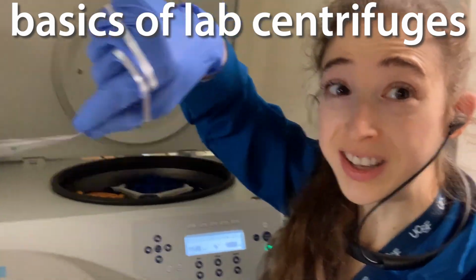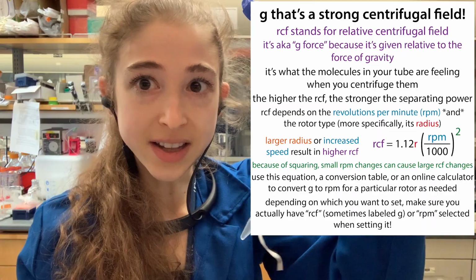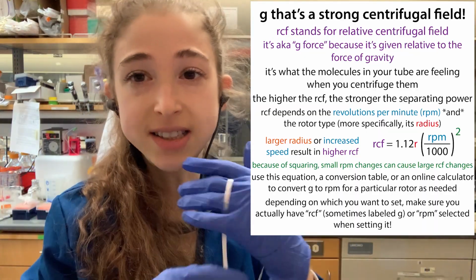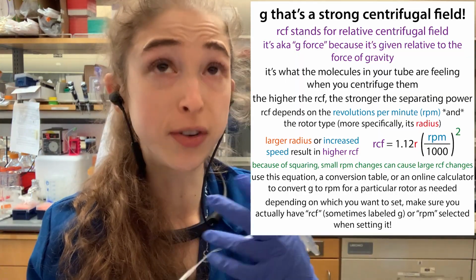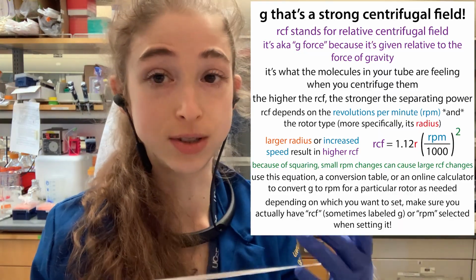Lab centrifuging can get kind of confusing, so here's a guide. The most confusing thing starting out, and something you want to make sure you have set correctly on your machine when you're setting things up, is whether you're dealing with RPM, revolutions per minute, or RCF, the relative centrifugal field. And it's relative because it is relative to the force of gravity.